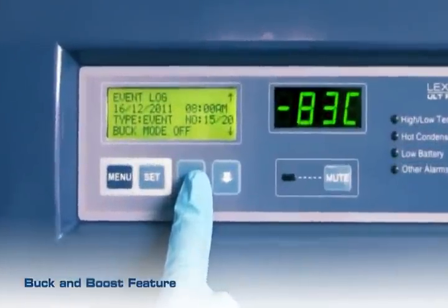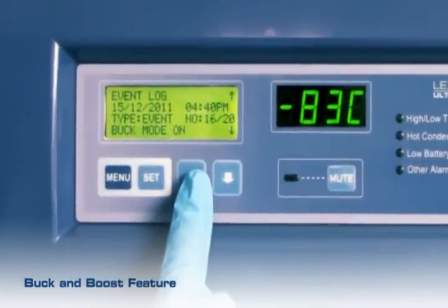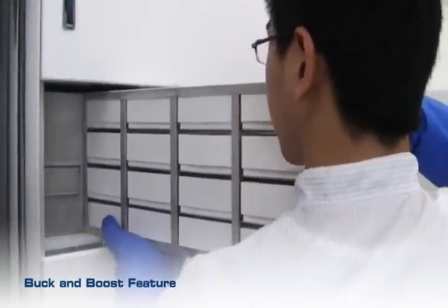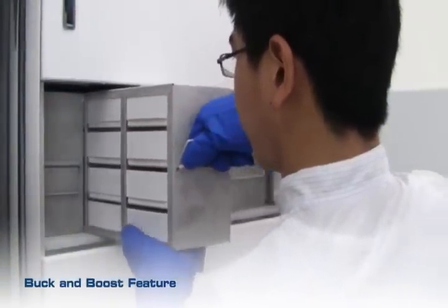The ESCO ULT Freezer is equipped with Bucken Boost, which ensures both compressors are supplied with an acceptable operating voltage and thus improves the lifespan of the compressors.